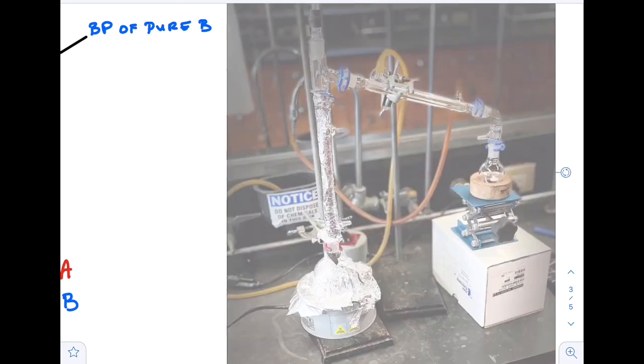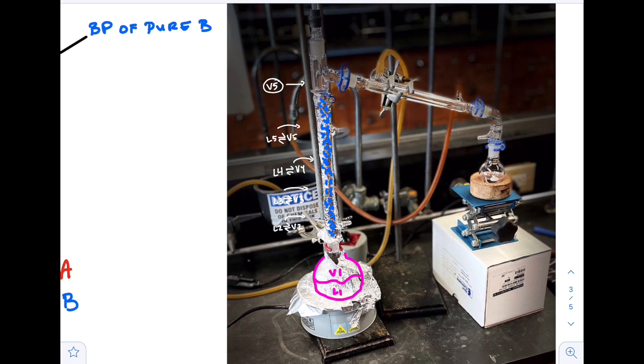Okay. Now, so again, L4 to V4, and then L5 to V5, and then the last one, what I've drawn here, V5 at the top. So that's the vapor over here. And then that vapor comes along, and then it condenses inside of this collection flask. And so in one setup, what this demonstrates is me doing 5 simple distillations, but only in one distillation. So that's the benefit and the idea of fractional distillation. Okay.